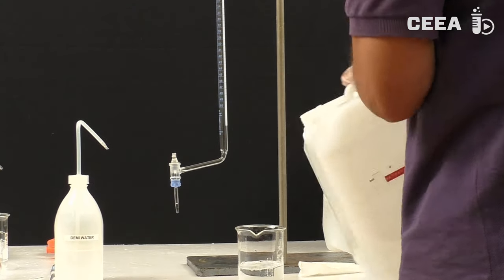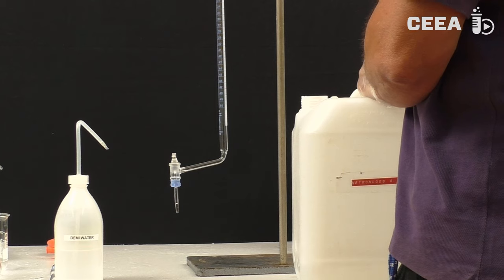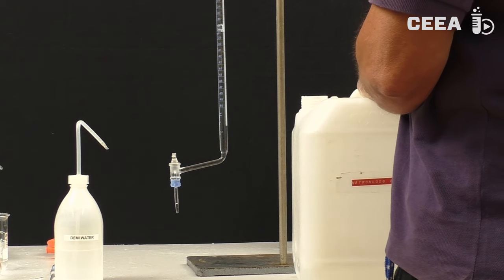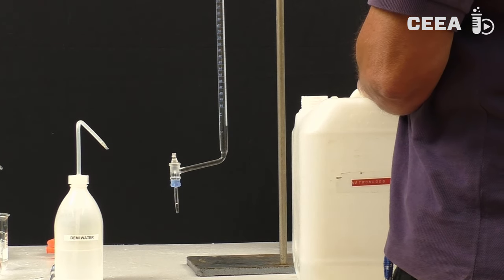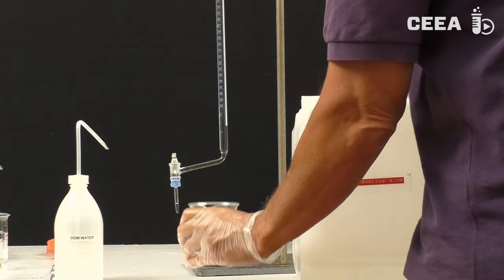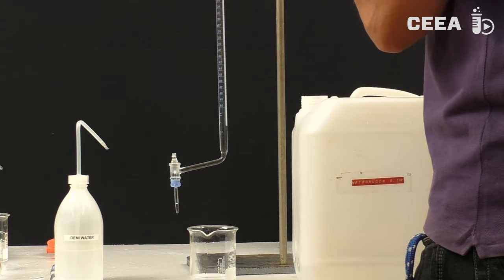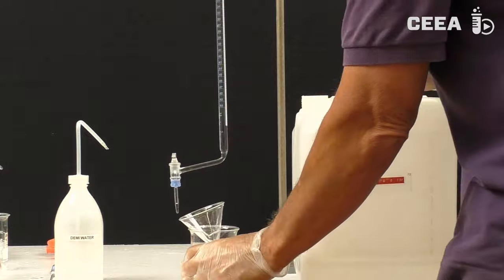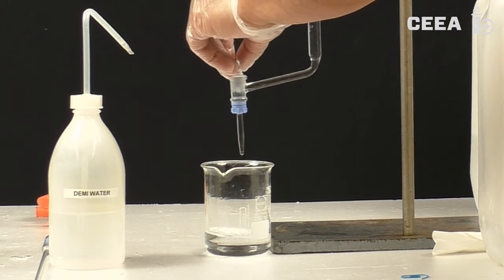The burette can now be filled with titrant. Allow a bit of titrant to escape in order to avoid air bubbles in the tap.